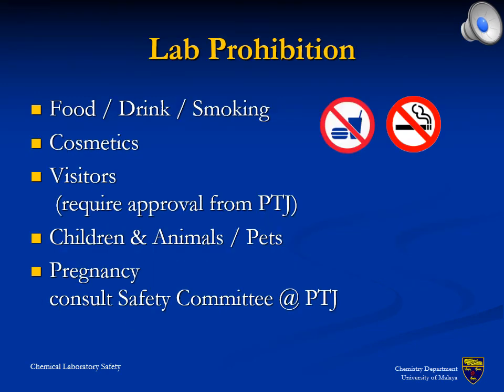In order to ensure safe operations inside chemical laboratories, the listed entries are forbidden.